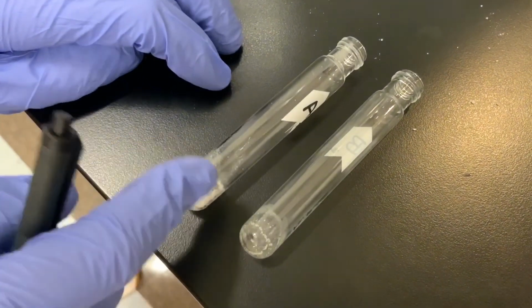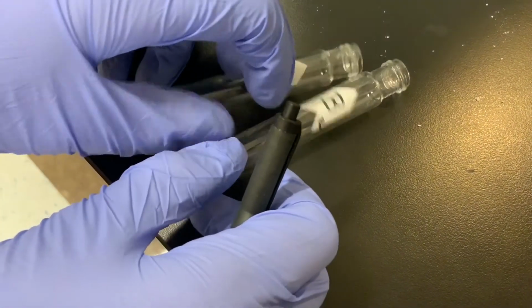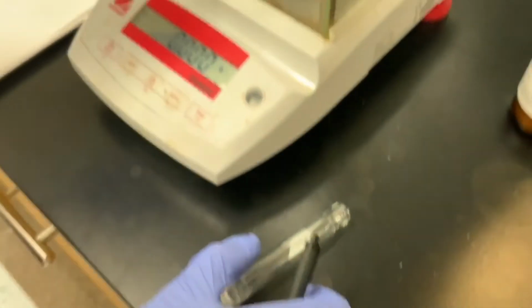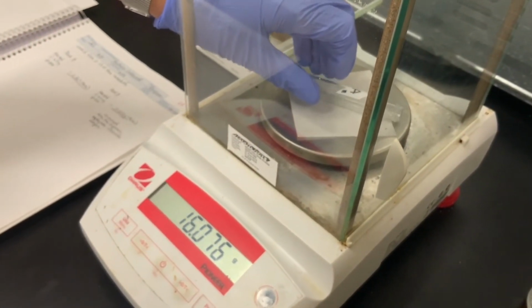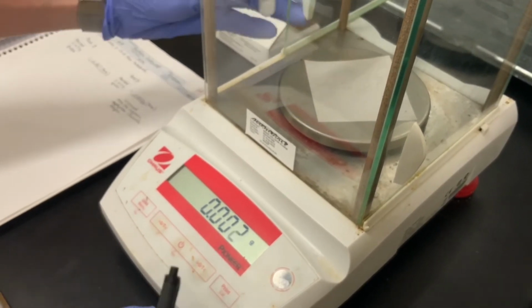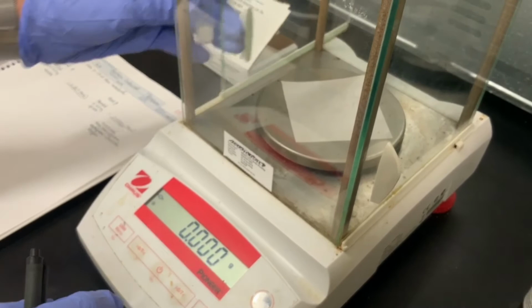Melting point 121 to 124 if it's benzoic acid. So now it's nice that we have a solid because we can still tip it upside down, but just to be safe, we're going to have it on its side now. Did I tare it? Double check.